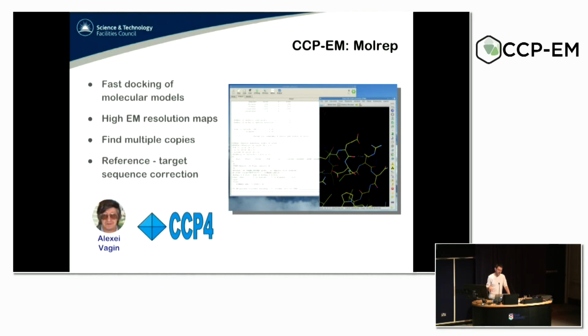And it can also optimize your sequence. So if you're using a replacement model with a different sequence than the one you expect, you can give that sequence, it will perform an alignment for you, and it will truncate your reference model to your target sequence.